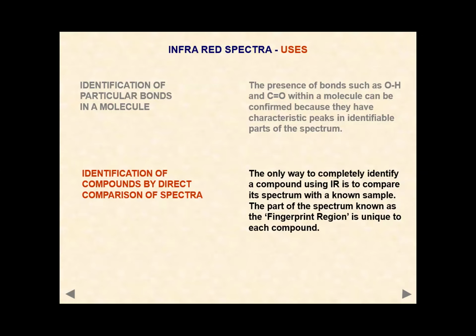If you remember, when we were doing the mass spectrum, I drew the peaks in an upward direction. Do you remember that? But when we look at the infrared spectrum, you will see that the peaks are in a downward direction. If you put your hand down, the fingers are pointing downwards. The same is the case with the spectra. So the peaks would be towards the bottom, just like fingers pointing towards the ground.